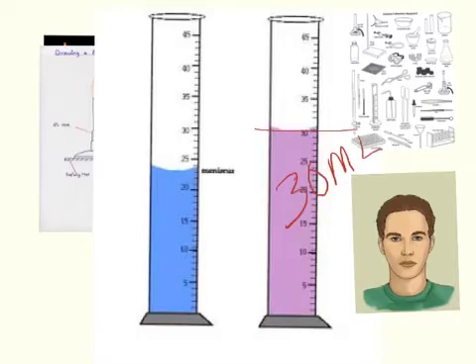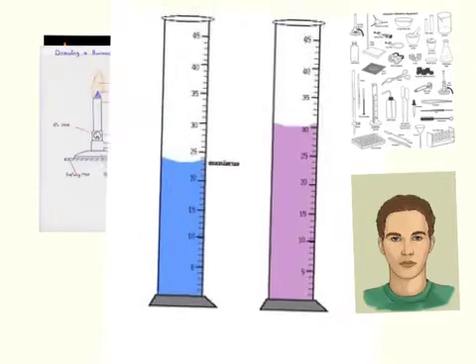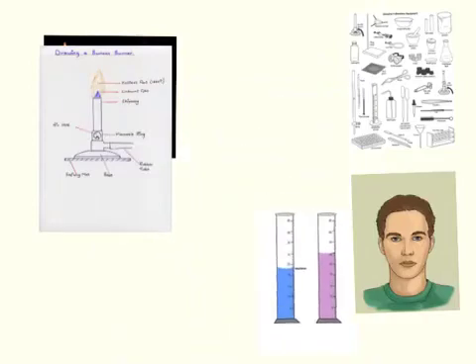What you do is you read it at the bottom. And this is called a meniscus. The meniscus is caused by surface tension of water, which will cause it to go up the side. The water will go up the side and make this nice little U shape. So whenever you measure this stuff, you want to always remember that the meniscus, you read it at the bottom. Graduated cylinders.